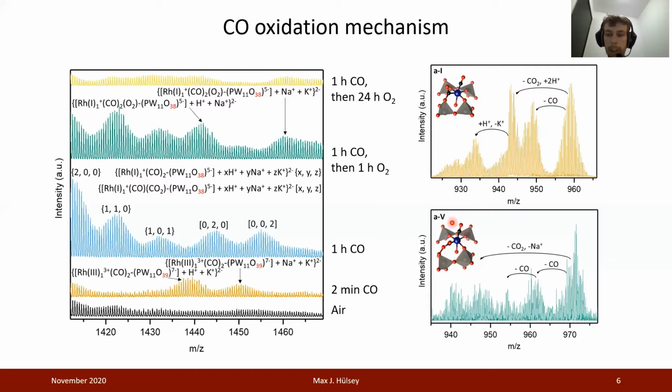We're following the same kind of logic. This is the state before the second CO oxidation in the whole reaction cycle, I will show you in a bit. If we fragment this intermediate, we can either lead to the desorption of both carbon monoxide molecules, or we can again form carbon dioxide, cleaving the dioxygen that is bound into the vacancy, and reforming the PW11O39.